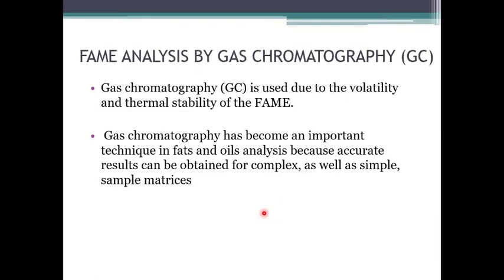So this FAME analysis is done by gas chromatography. The main reason being the FAMEs are more volatile and thermally stable than the fatty acids. And as we all know, gas chromatography has become a very important technique in fats and oil analysis because it gives accurate results obtained for complex as well as simple sample matrices.